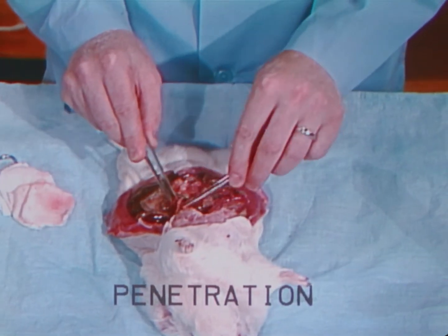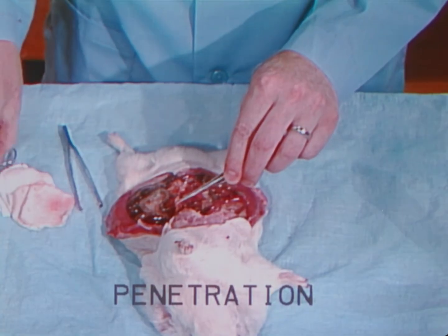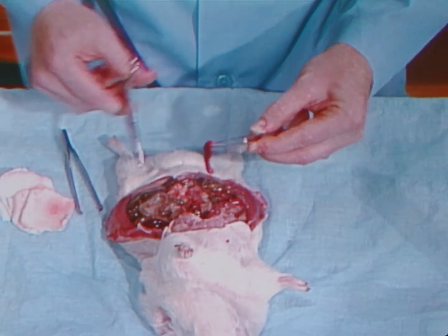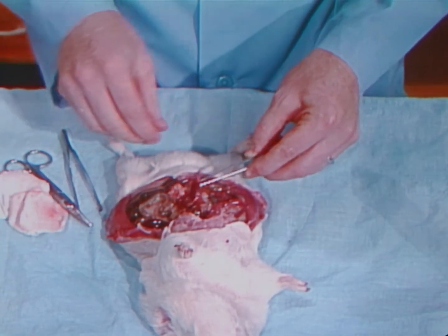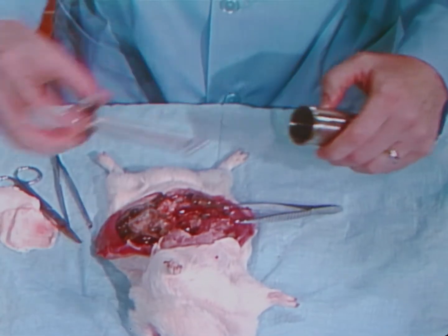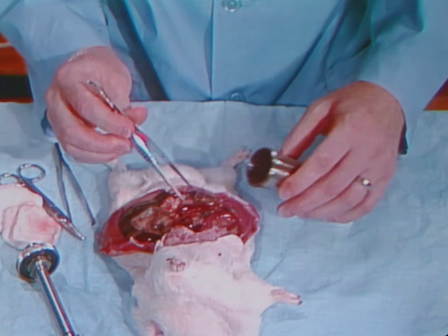Penetration of unbroken skin is also an important route of infection. Tularemia is an example of an infection that may result from penetration of unbroken skin as well as from accidental inoculation or inhalation.